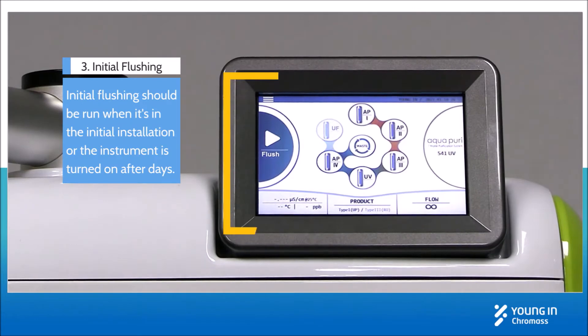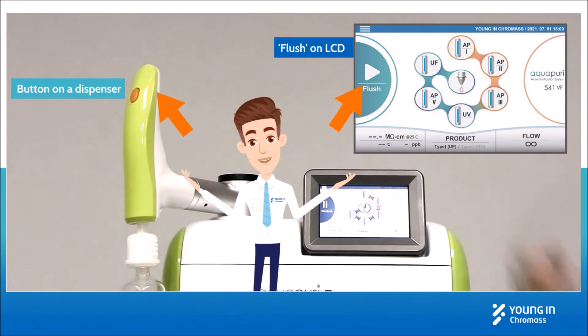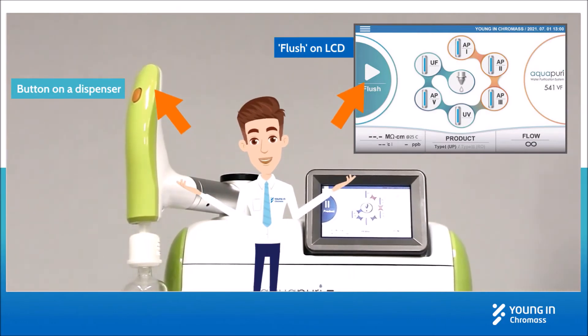Run the initial flushing. You can flush the system by pressing either the button on the dispenser or flush on the LCD.